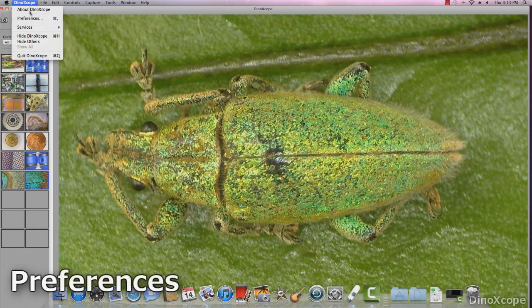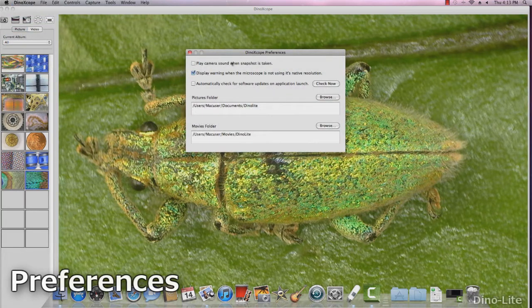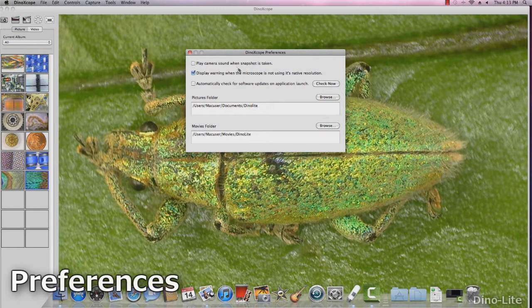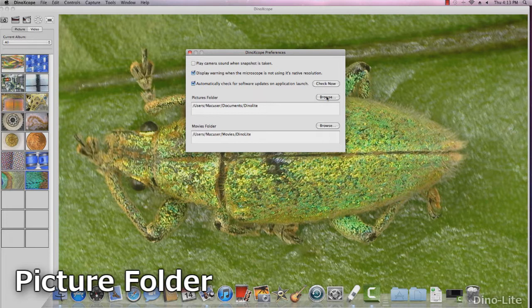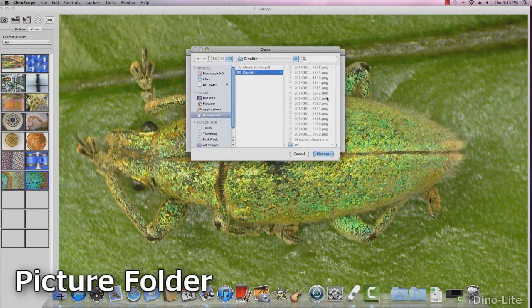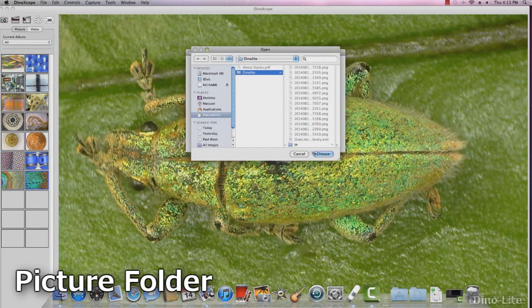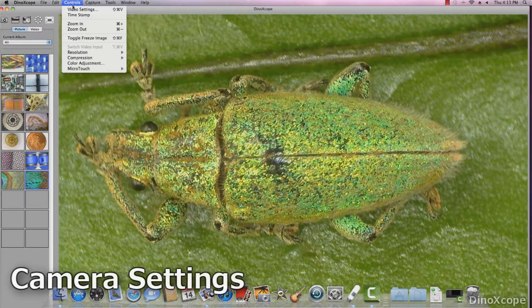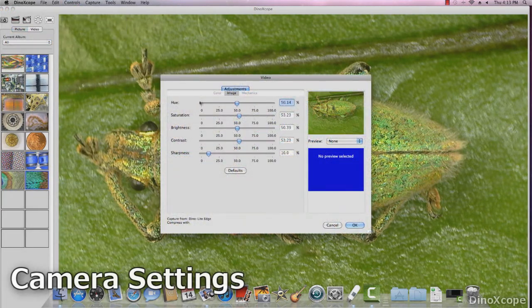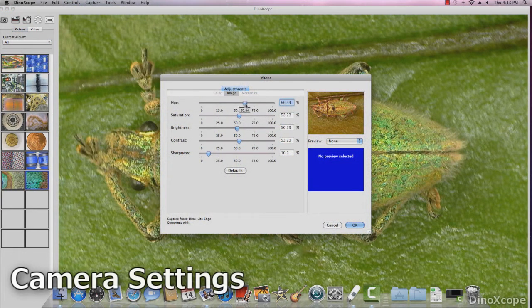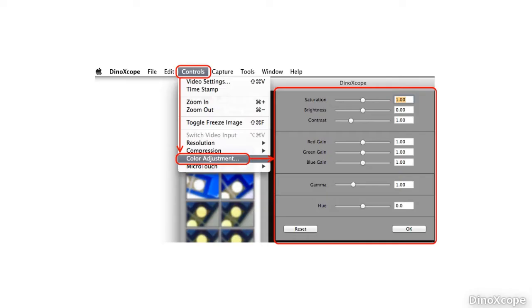Access the DynoXscope preferences to adjust some other options including the pictures and videos folders. The picture folder allows you to change folders to import existing DynoXscope images and to change the current saving folder. DynoXscope has additional camera settings and color adjustments that allow users to adjust the imaging results to the outcome they desire.